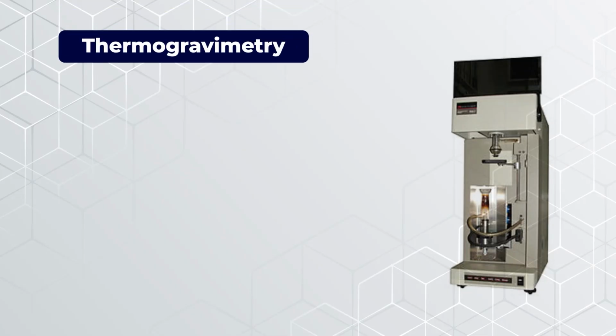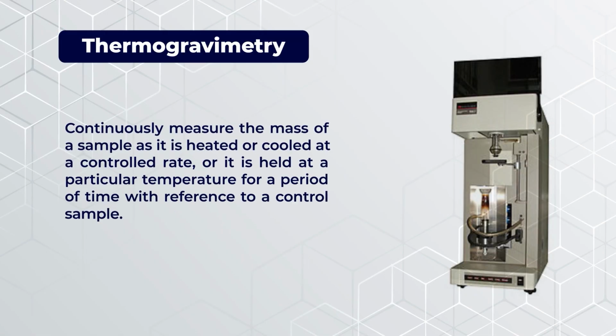Let us talk about the technique thermogravimetry. As the name suggests, thermo and gravimetry. What we do here is we measure the weight of the food sample which is being heated at a constant, given rate, and with time we measure the weight. So we plot the loss in weight with temperature, that is thermogravimetry. To say it, continuously measure the mass of a sample when it is heated or cooled.